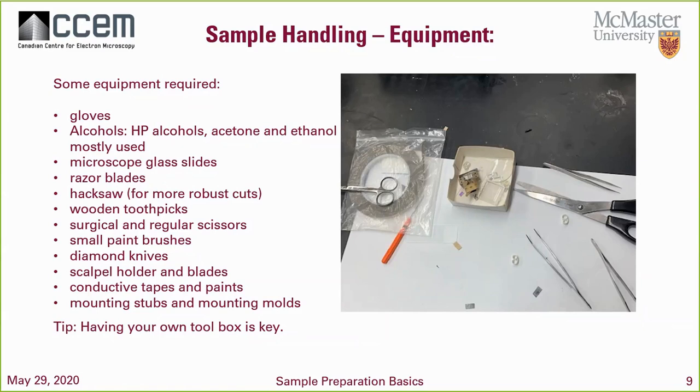You want microscopy slides, glass slides, which are extremely useful. Let's say you wanted to cleave something. I tend to use glass slides as a base to cleave, like a silicon wafer from time to time, or something like a semiconductor. Razor blades, again, for cleaving. Hacksaw, let's say you wanted to make rougher cuts to a sample. Wooden toothpicks, I'll show you one application of wooden toothpicks.